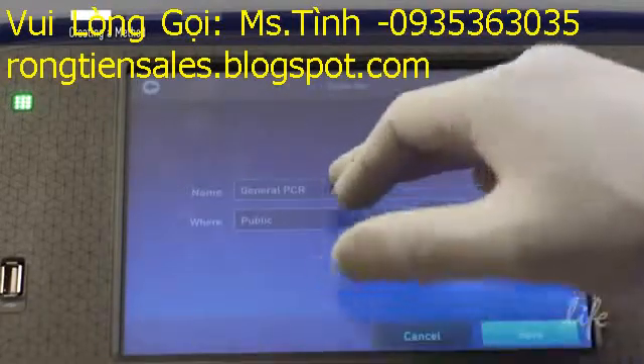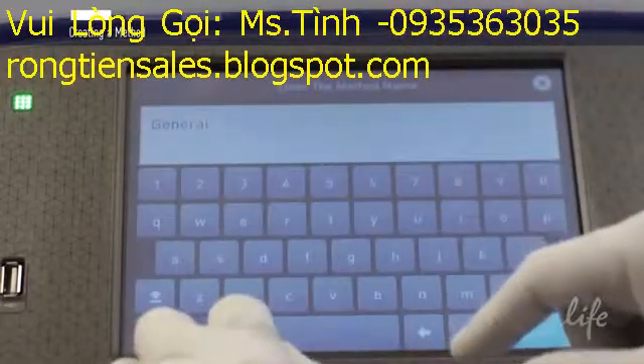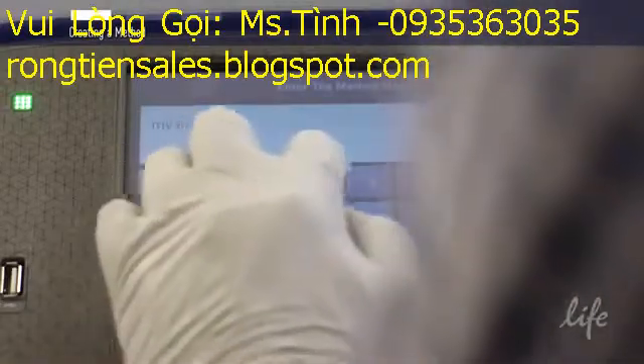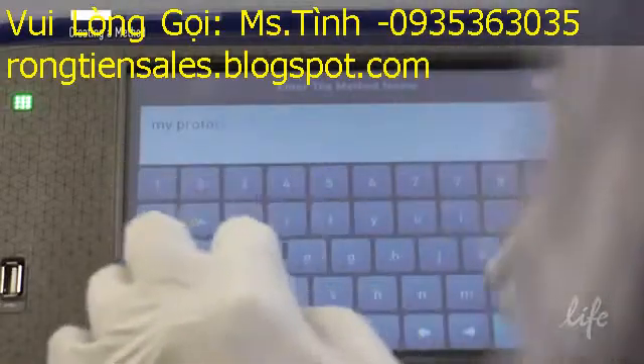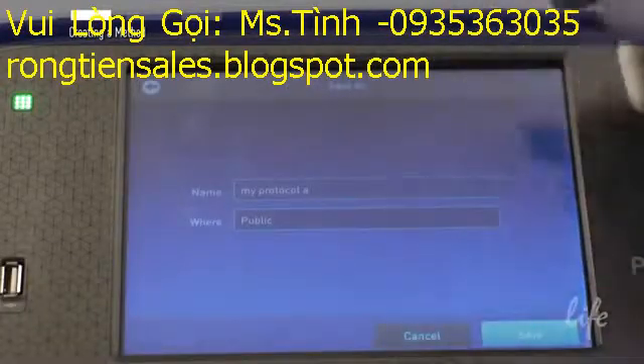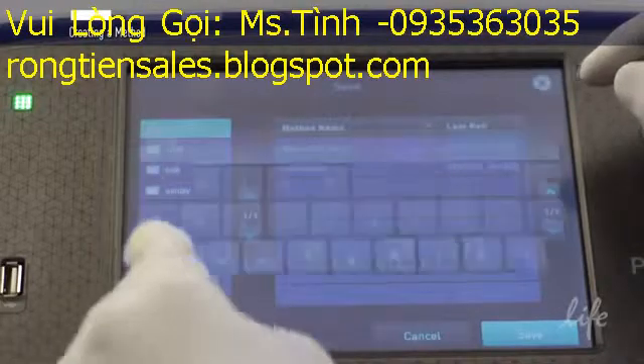Enter a name for your protocol. In this case, we will call it MyProtocolA. If you would like, you can save the protocol in your personal folder for future use.